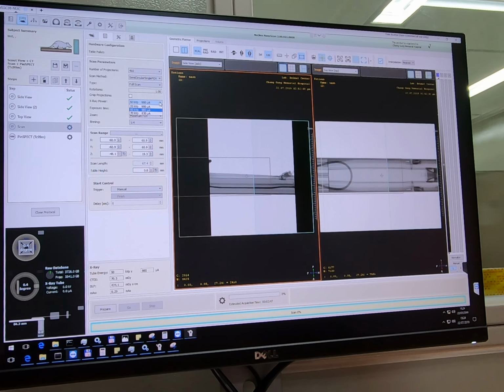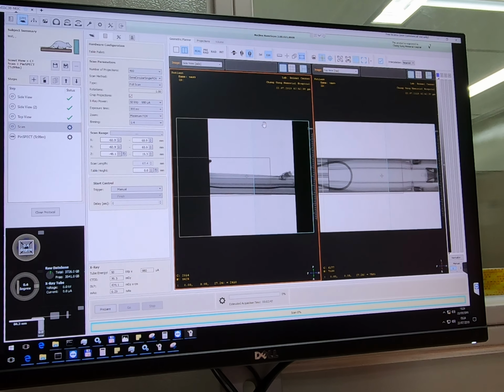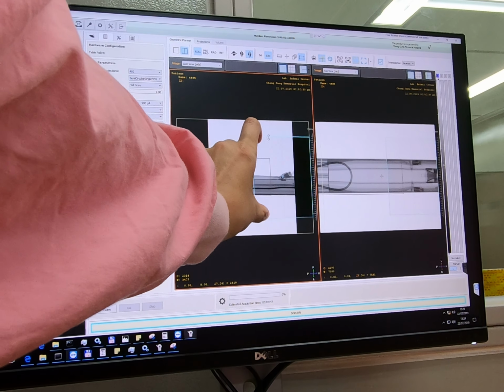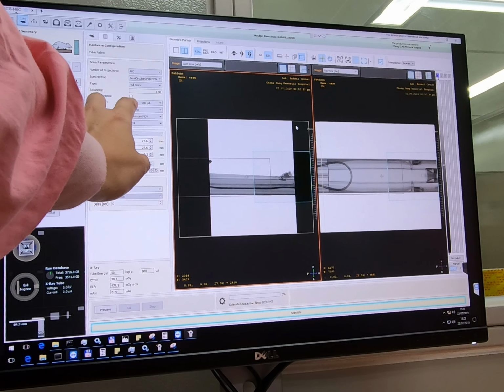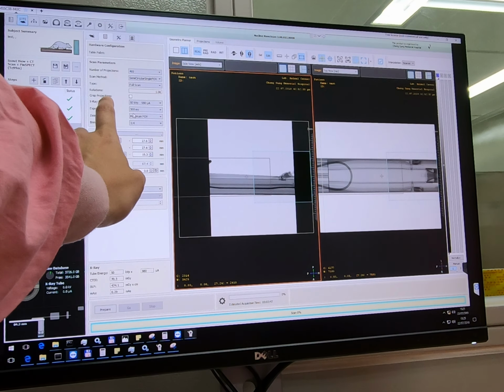If we did not collect this, it will save the whole data. What is this? Can this be fixed? Once you tick it, you can shrink it. Even if you did not click it, you can still shrink it, but if you did not click it, you still scan this part. So what is that for?